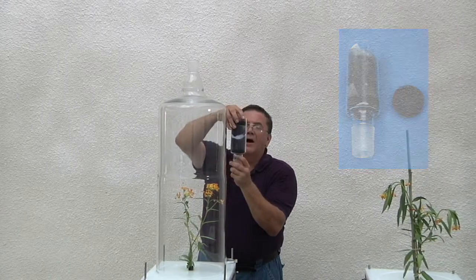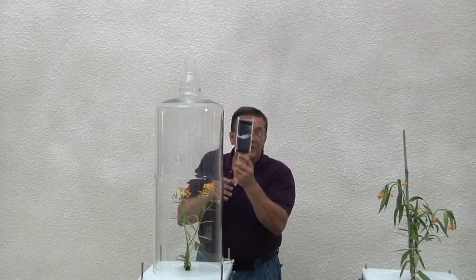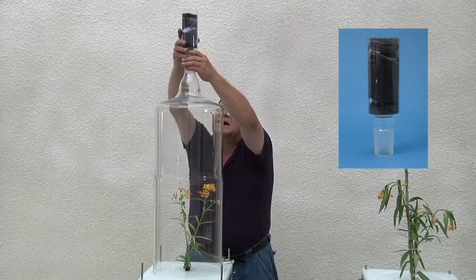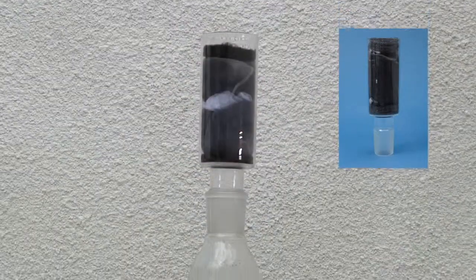Our filtering unit allows for air to flow freely from the lab into the system. It has multiple layers of activated carbon.